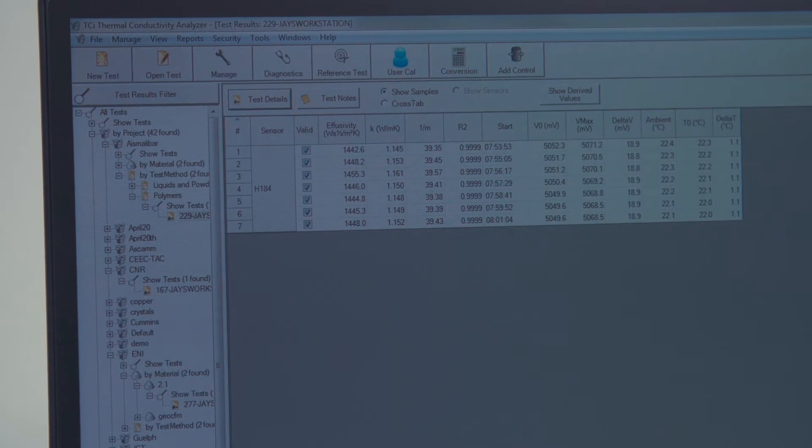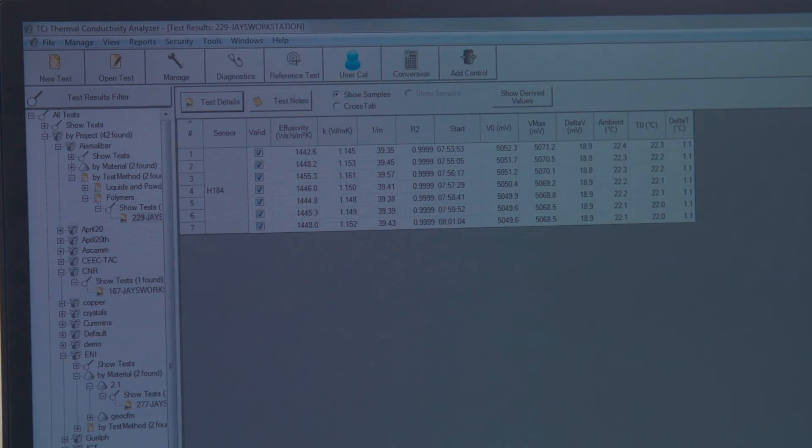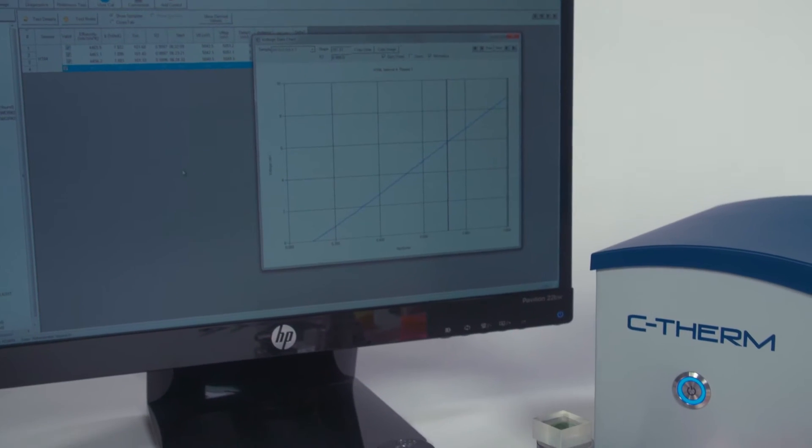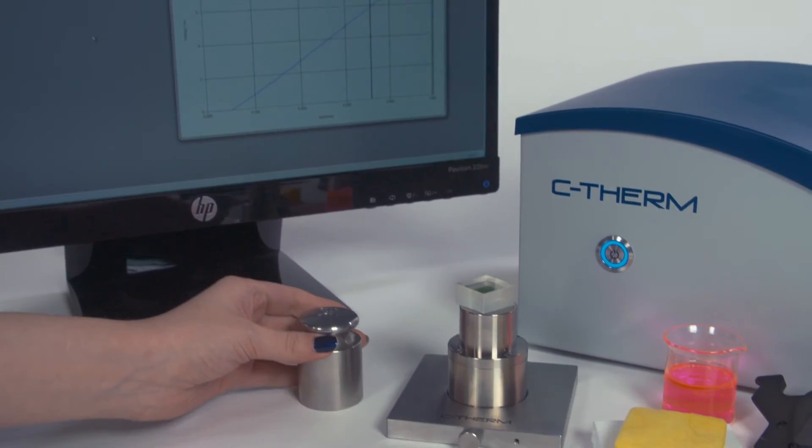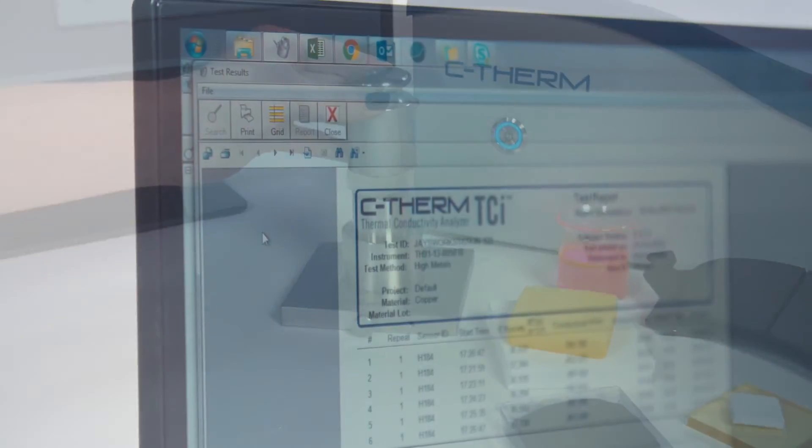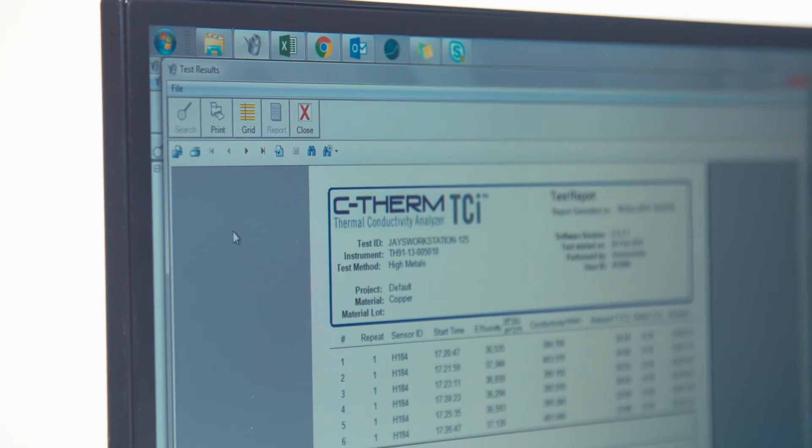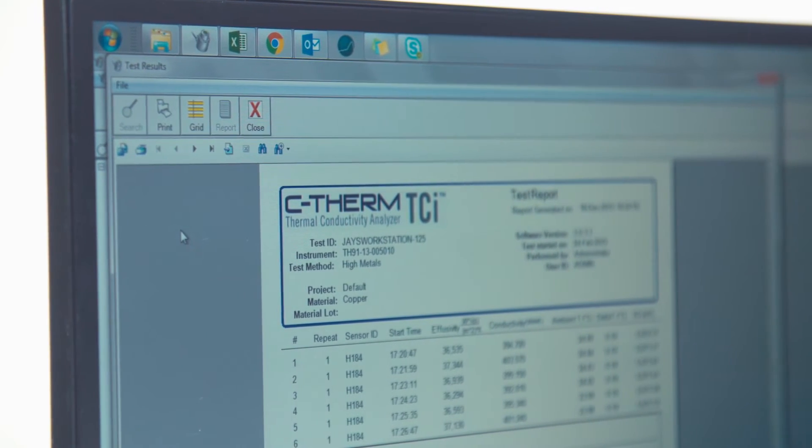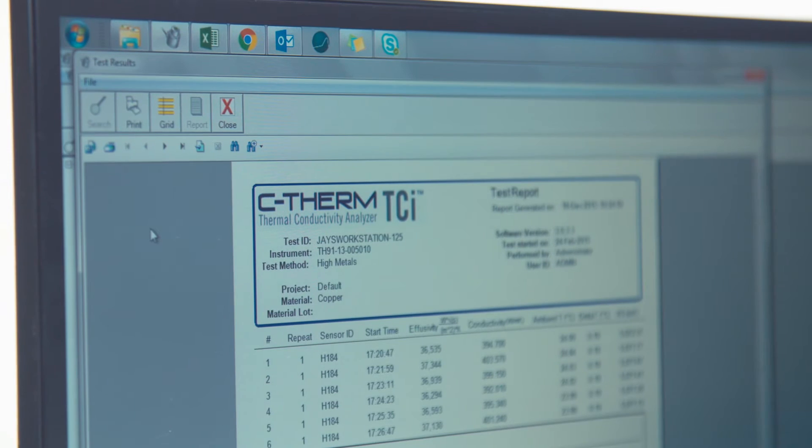The TCI software includes a full relational database with automated test report generation and offers easy export to Excel. The system also provides the ability to derive other thermal properties such as heat capacity with additional user inputted density data.